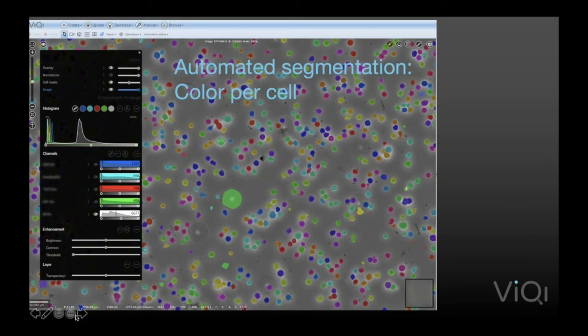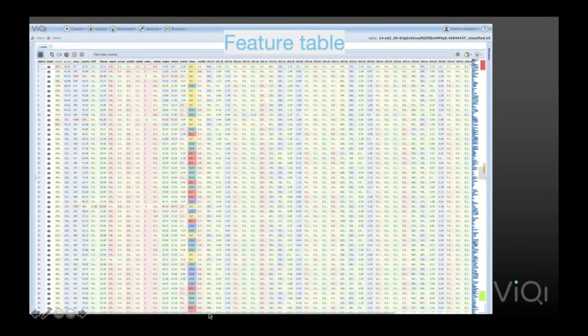And in the next slide, let's see, what is it that we're actually sending to the AI? So when you click on cells, or the segmentation algorithm identifies them for you, you can extract a lot of standard descriptors of these cells. There's the image mask, the individual pixels that comprise the cell. And you can get various kinds of textures, or the perimeter shape or form factors, etc. Those are natural numerical descriptors of what these cells are. And so, these are all in these different columns here.